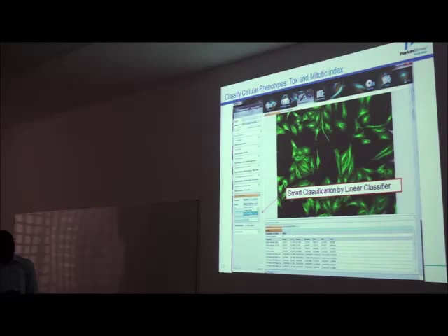For instance, you say find the nuclei, the software will find the nuclei, find cytoplasm, we add it. Then you calculate intensity properties, morphology properties, like area, for instance, here, and intensity here. And you calculate texture properties, just what I showed before: ridge, valley, saddles, and holes. And then you use this linear classifier.